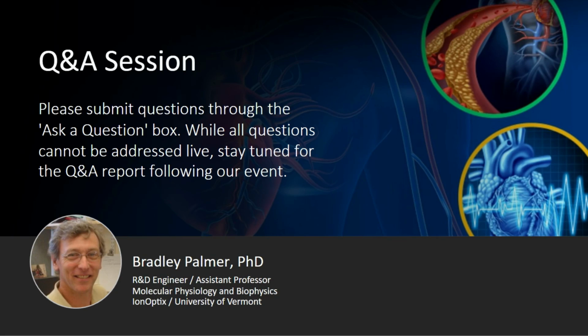Okay. Next question. How many slices do you get from one heart? It will depend a little bit on how thick you make your slices. But if you use a typical 300 micron thickness, you might get anywhere from 5 to 10 viable, useful slices from a rat heart. From a mouse heart, it's different. You might only get 2 to 4 from a mouse heart. But again, it will depend a little bit on how thick your slice is.